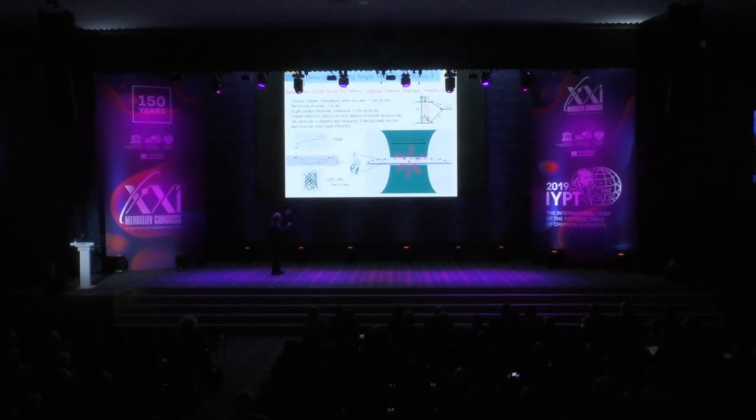But now imagine you're focusing your laser to a small spot, and remember that diffraction effect that I mentioned a few moments ago. It limits the minimum size of that spot to a few hundred nanometers. So the molecules are 1 nanometer in size, but this laser spot is a few hundred nanometers in size. So now you see that to pump a single molecule, you have to dilute them. You have to make sure that they're farther apart than the size of this laser beam. So if you do that, you'll be able to detect single molecules, done carefully.